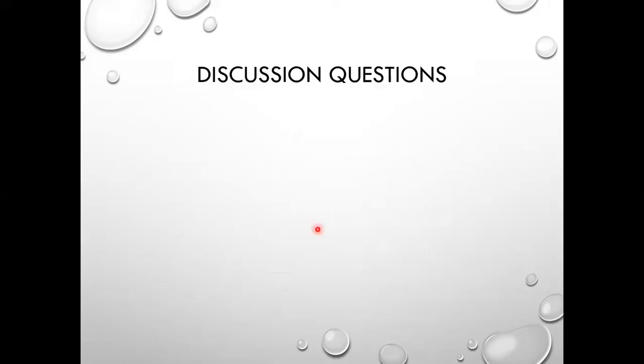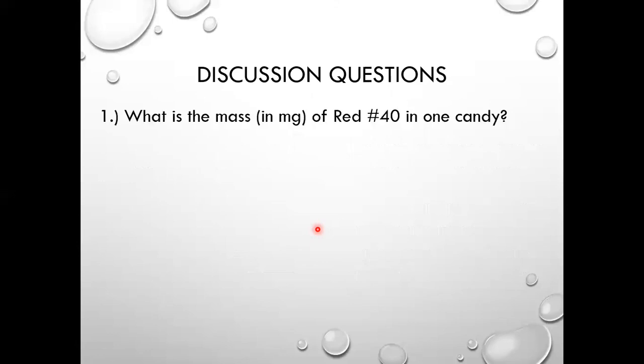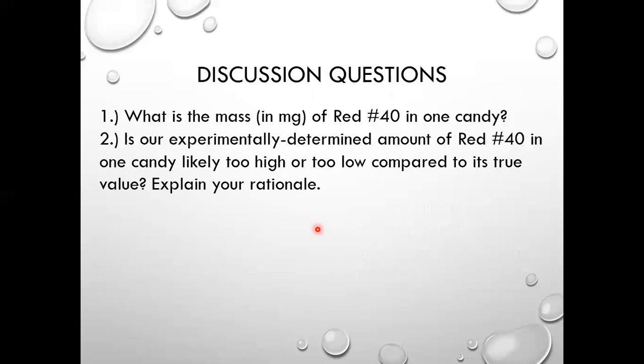And then finally, some discussion questions. First, just simply answer the question of the day. So what is the mass in milligrams of red number 40 in one piece of candy? As always, take into account significant figures.